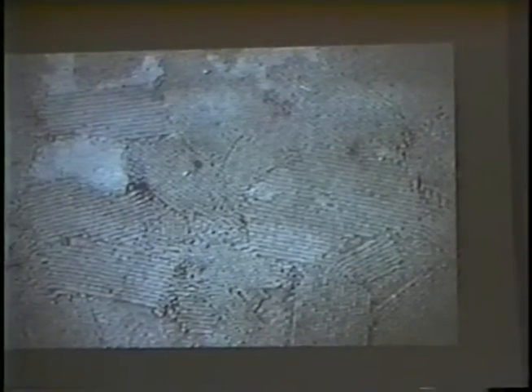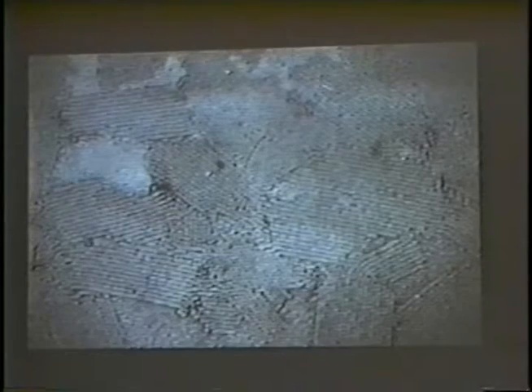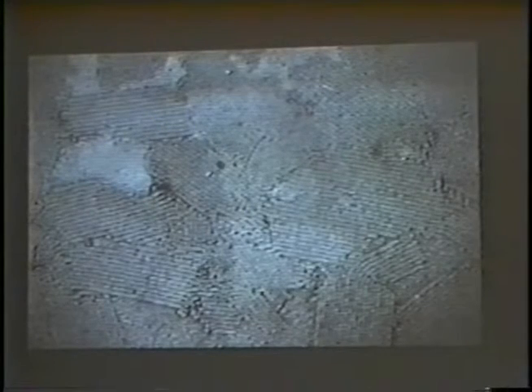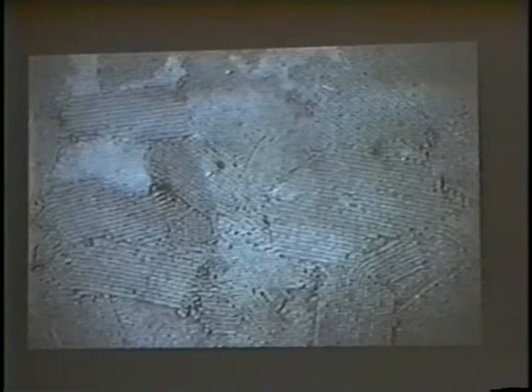The very recent work that I've been doing indicates that human erythrocyte catalase has a tendency to form a second and possibly even a third crystalline state. And here we have small patches of crystallinity within which the molecule is certainly orientated somewhat differently, probably on edge, compared to the previous two-dimensional crystals that we have analyzed so far. And in my final slide, the possibility of a third crystalline state.